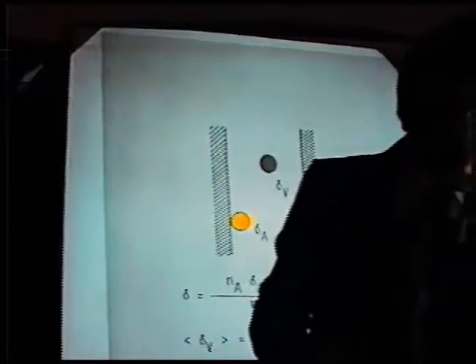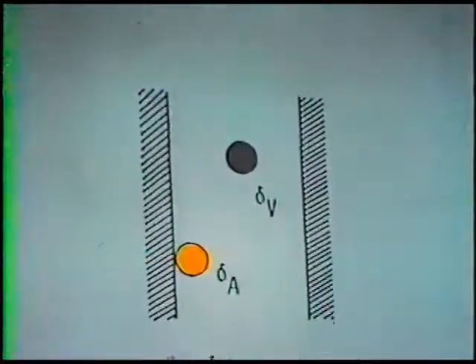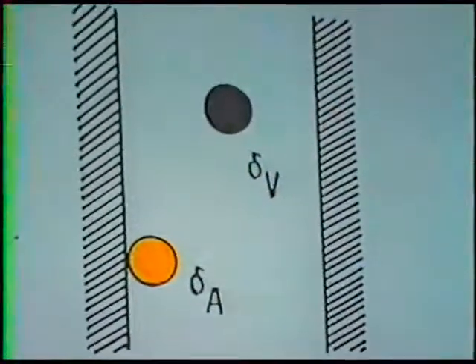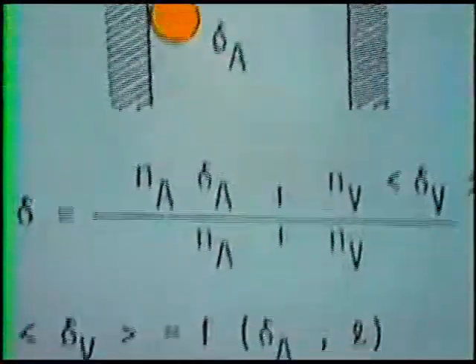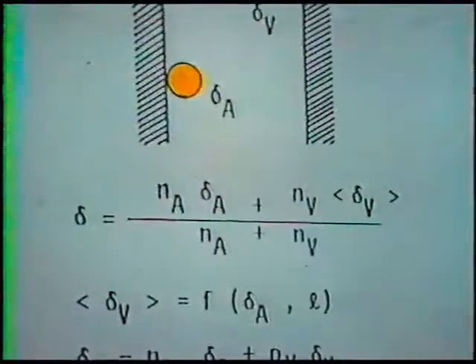And we have thought that the parameter able to define altogether these different things, that is the size, the structure, the ease of diffusion, is what we have named the free space, the mean free space imposed by the structure.